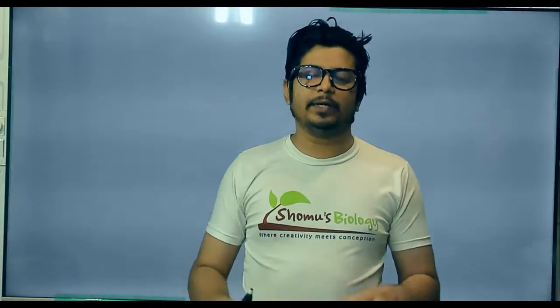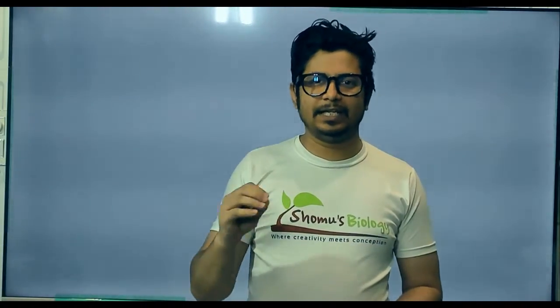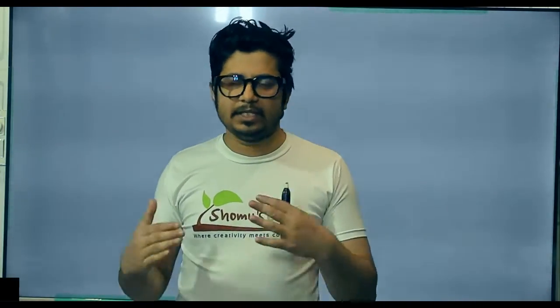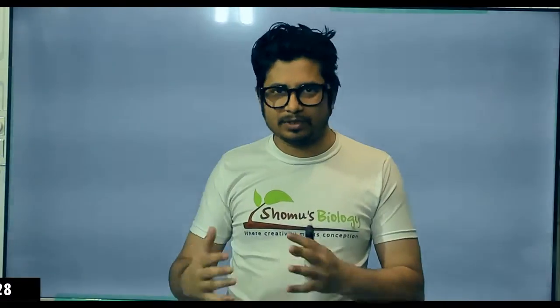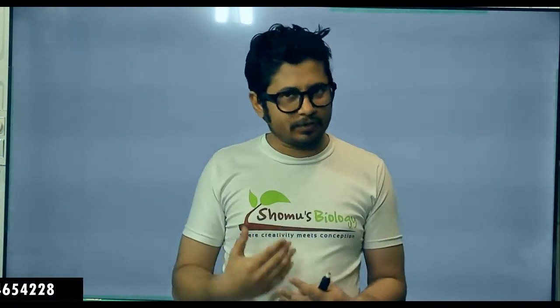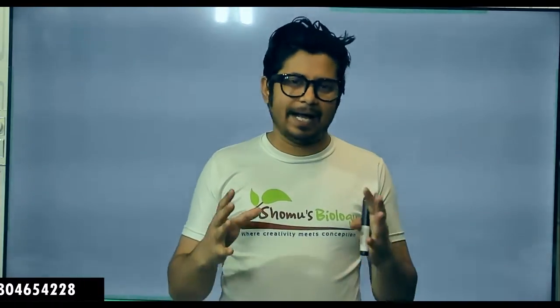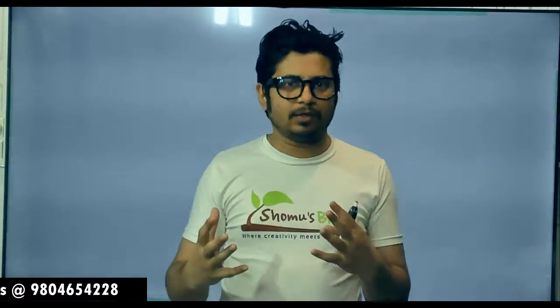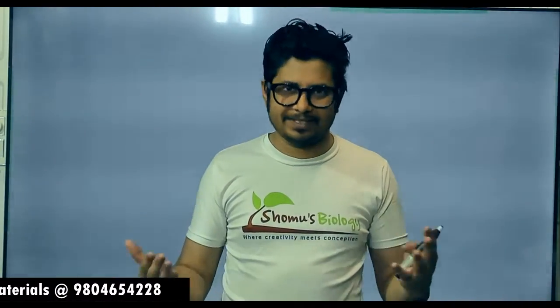In this video lecture, we are going to talk about gel electrophoresis. In this series of lectures, the first lecture is all about agarose gel electrophoresis. We'll first talk about the basic principle of gel electrophoresis. Then we'll talk about agarose gel electrophoresis, which utilizes the agarose gel to separate a mixture of DNA fragments, okay?